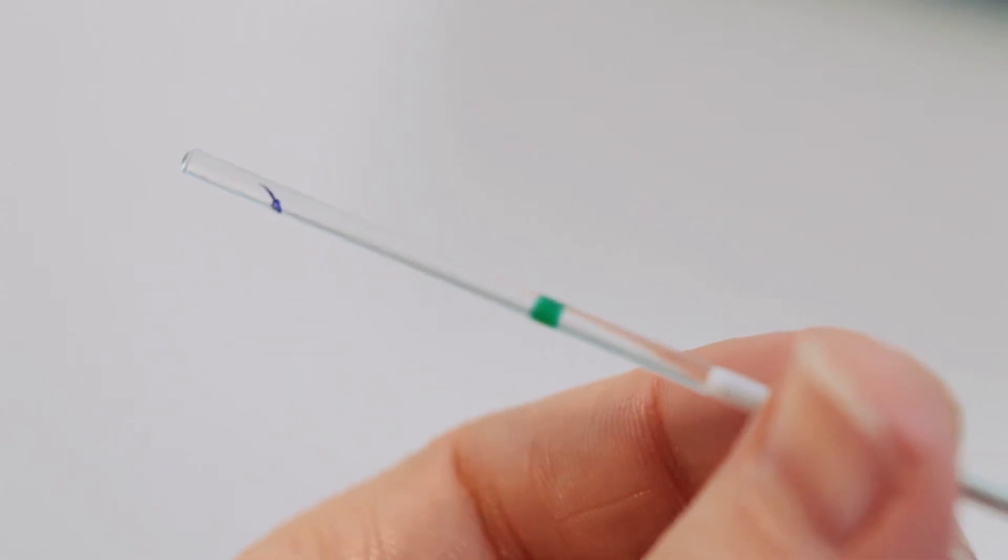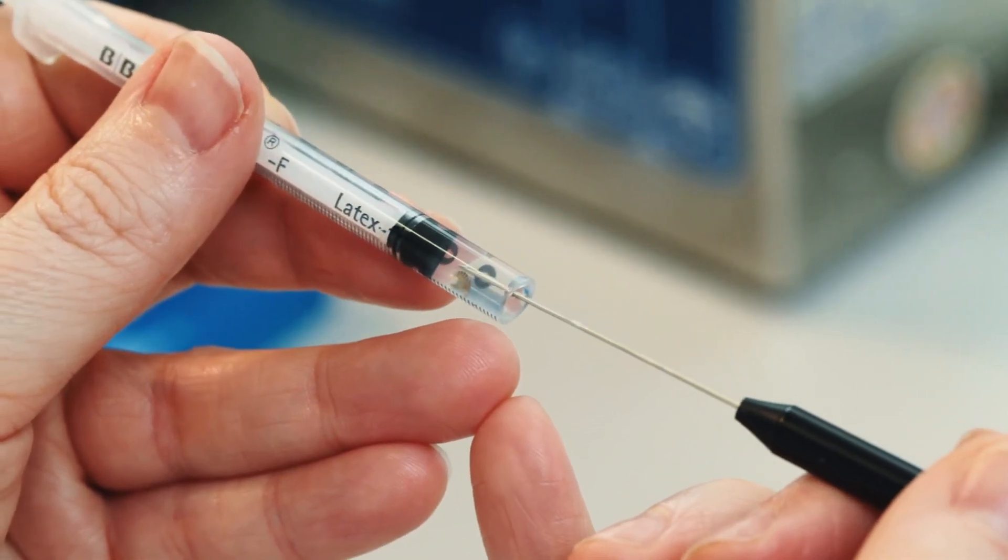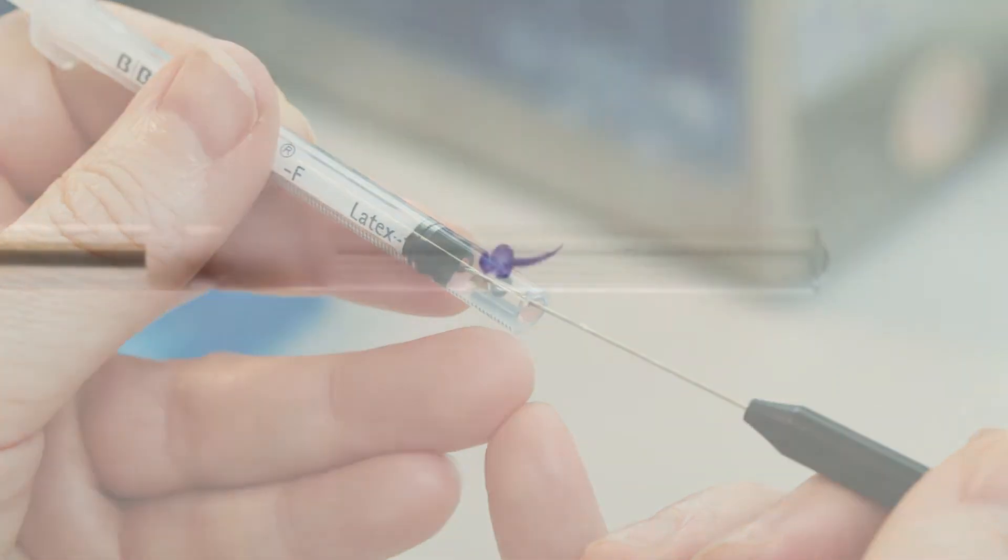Rotate the capillary to align your sample in the center of the cylinder. Finally, use a needle to position your specimen while the agarose hardens.